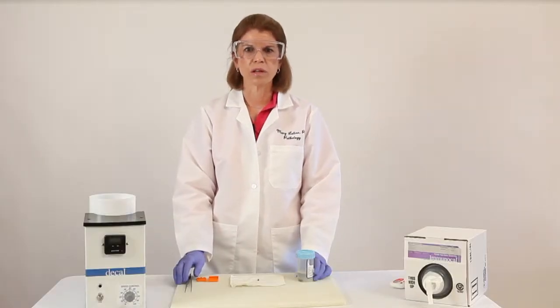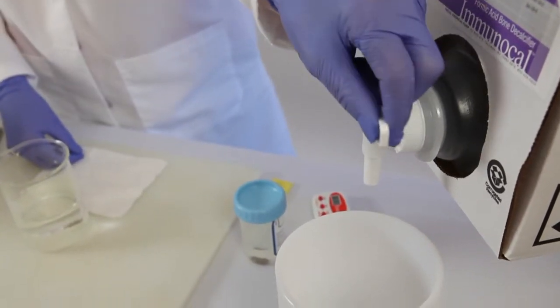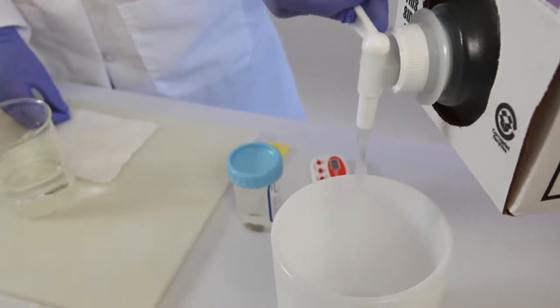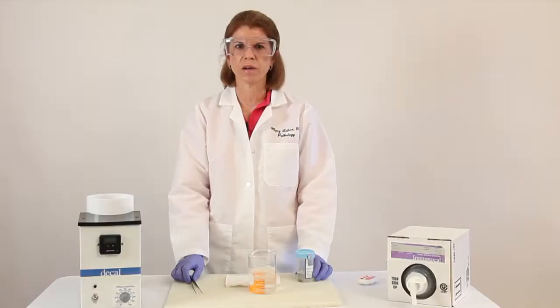So start by pouring your decalcifying solution into a beaker. I use ImmunoCal from DeCal for bone cores. In addition to having these little cube containers that are easy to pour, it's a very mild formic acid decalcifier.